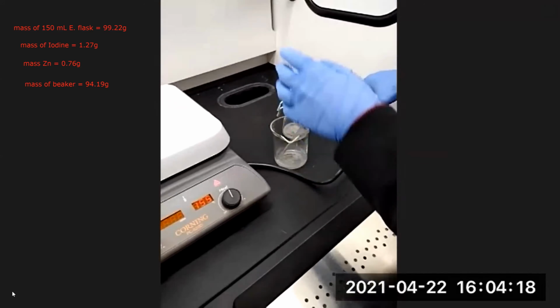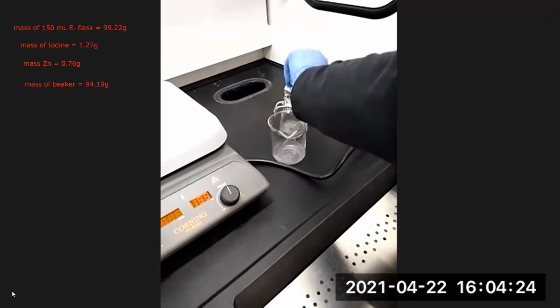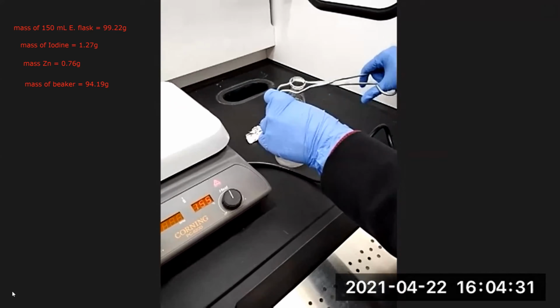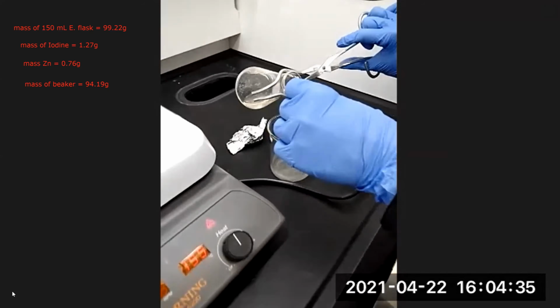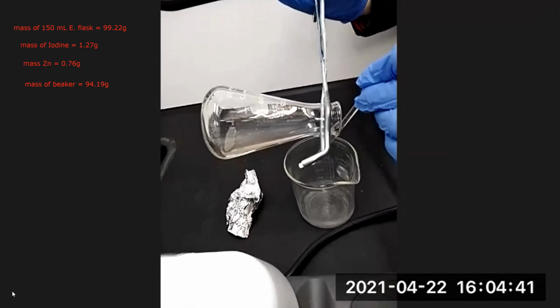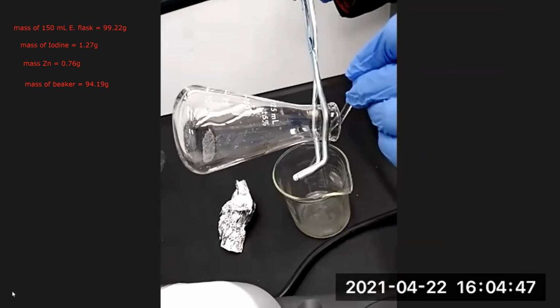We use a glass stir rod to help prevent any spilling or splattering of the solution when we're pouring it. So we pour it along the stir rod, and that minimizes the splattering when pouring.